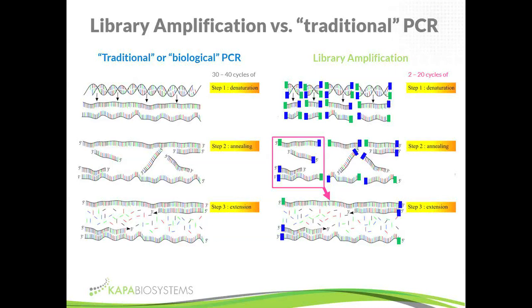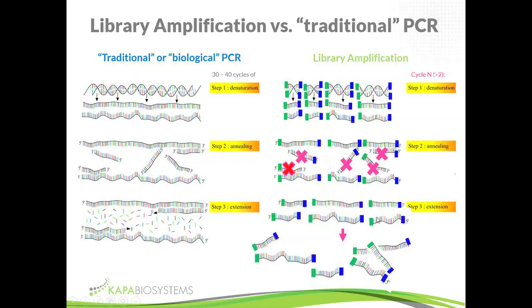Very quickly, the primer runs out. And so when you denature your molecule, there's no more primer to anneal, and what you end up with at the end of the extension reaction, instead of a double-stranded DNA molecule, is a bunch of single-stranded molecules which have no complementary partner, because there was no primer to prime the extension of the complement.